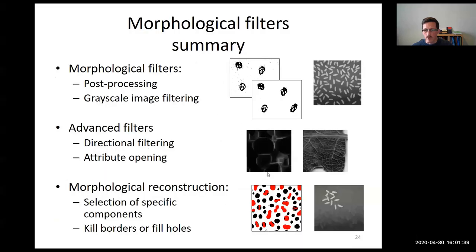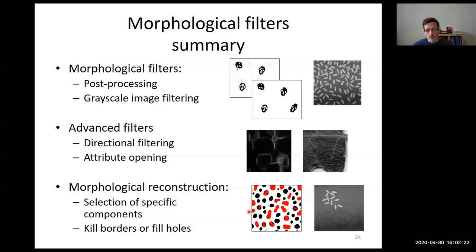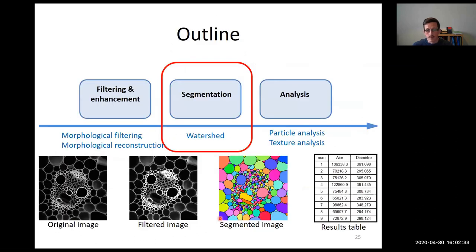To summarize on morphological filters: they are useful either for processing binary images or for improving grayscale image quality. It is possible to play with the shape of the structuring element to improve specific structures like curvilinear ones, or to use attribute opening considering only connected component size. Morphological reconstruction can greatly help improve segmentation quality by selecting objects and reconstructing their original shape.